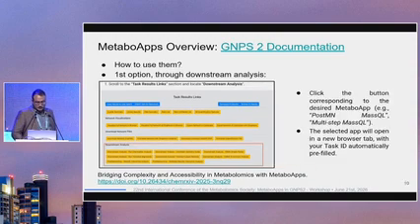And also, some of those, such as the food readouts and the drug readouts, are not implemented as a downstream analysis directly on the job page, but they are implemented as a web server. So that's one of the things that I'm going to show after now.